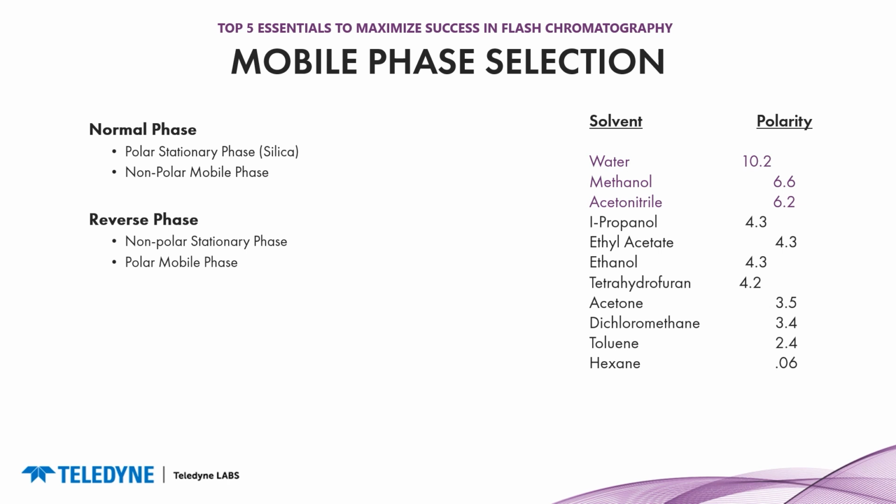So in reverse phase, we're actually going to start with the most polar solvent. Most times you're going to have water as your first solvent, and then you're going to either use methanol or acetonitrile as your strong solvent. So the strong solvent in reverse phase is actually more non-polar. If we look at methanol and acetonitrile, they're going to interact more with the C18, the C18AQ, or the C8. So that's going to be able to pull more compounds off of that non-polar stationary phase.